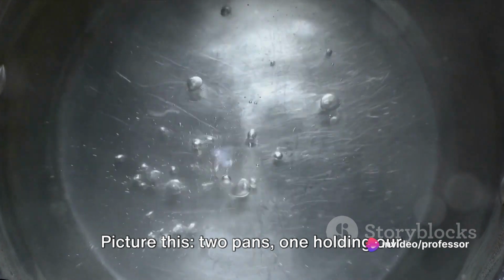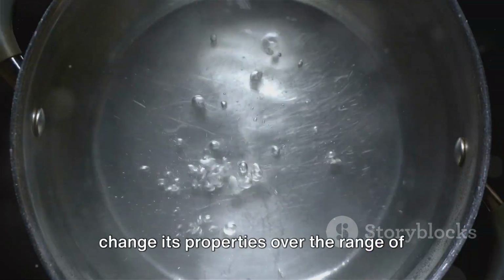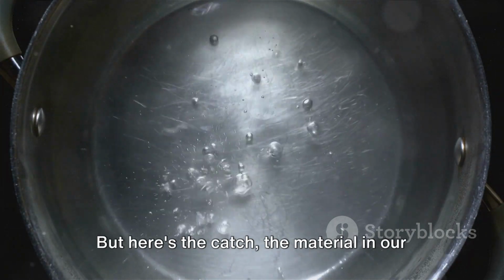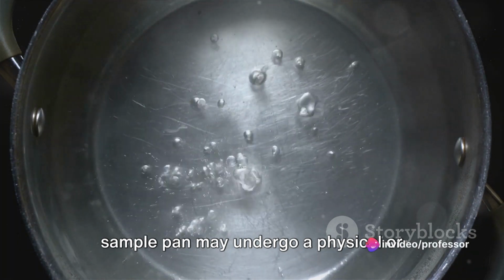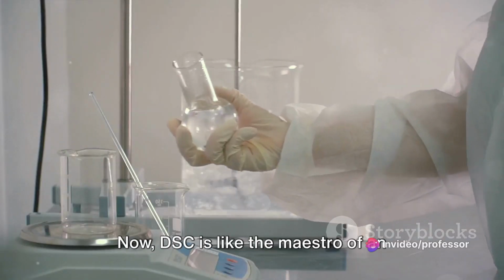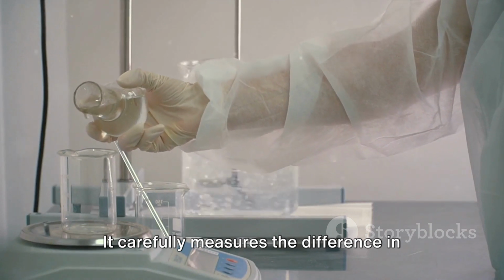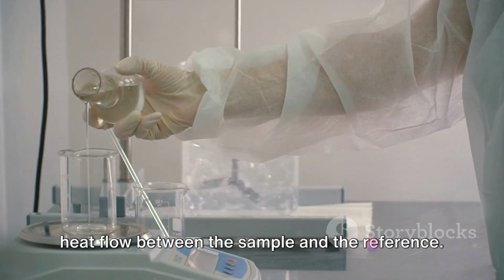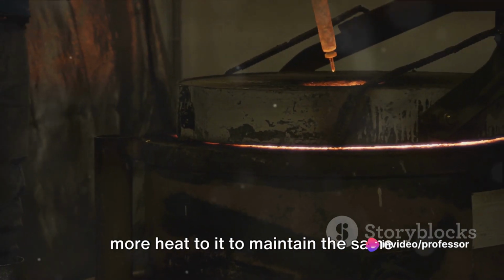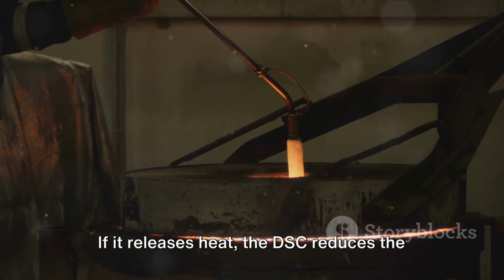Picture this. Two pans, one holding our mysterious sample and the other an inert reference, usually a material that doesn't change its properties over the range of temperatures being used. Both pans are heated at the same rate. But here's the catch. The material in our sample pan may undergo a physical or chemical change, and when that happens, it will either absorb or release heat. Now, DSC is like the maestro of an orchestra, controlling and observing this performance. It carefully measures the difference in heat flow between the sample and the reference. If our sample absorbs heat, the DSC adds more heat to it to maintain the same temperature between the sample and the reference. If it releases heat, the DSC reduces the heat input.